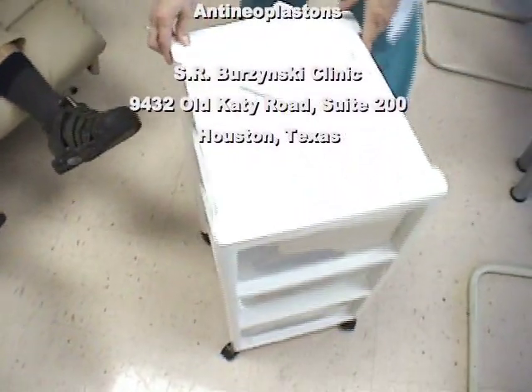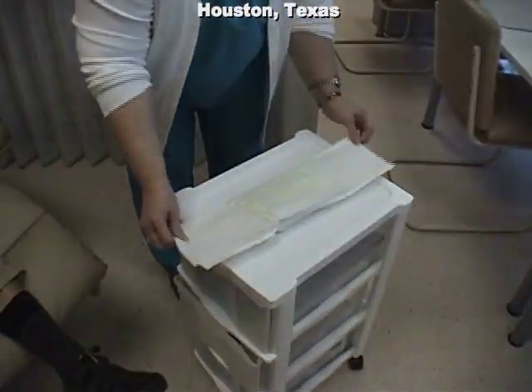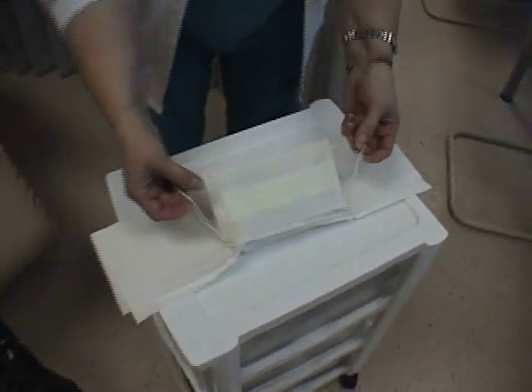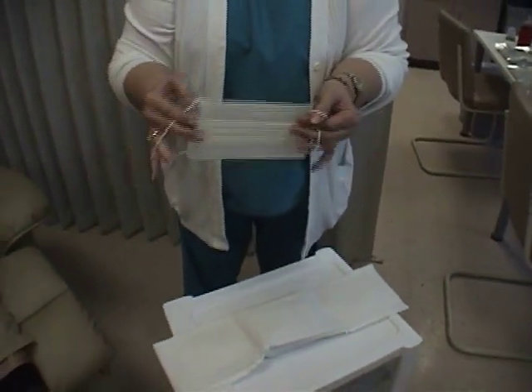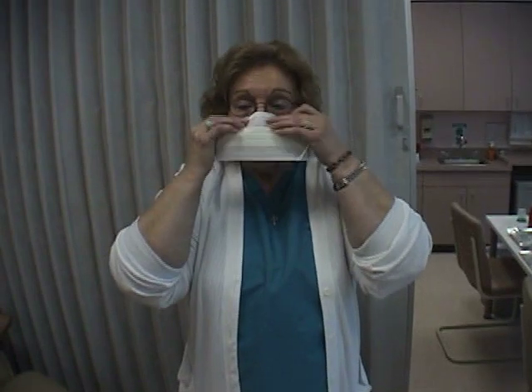Okay. What I'm going to do is open up the kit. On top we have one mask. The mask is taken and put on like so. There's a wire at the top. You bend it over your nose. Just put the little rings around your ears. Spread your mask out so you don't die of heat stroke.